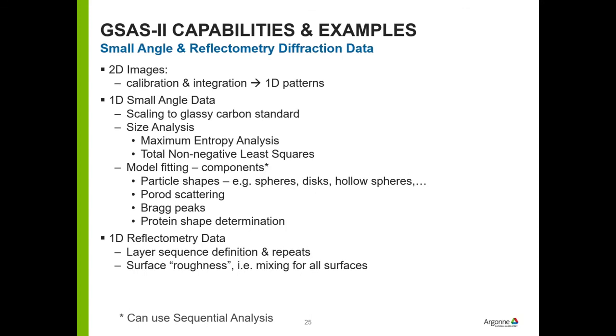By the way, the code for GSAS-II, I told you it's 150,000 lines of code. 50,000 of it is dedicated to powder diffraction. Around 2,000 is dedicated to small angle scattering, and about 500 to this. This is a very simple problem. Rietveld refinement is a complicated problem. And the amount of code tells you that.